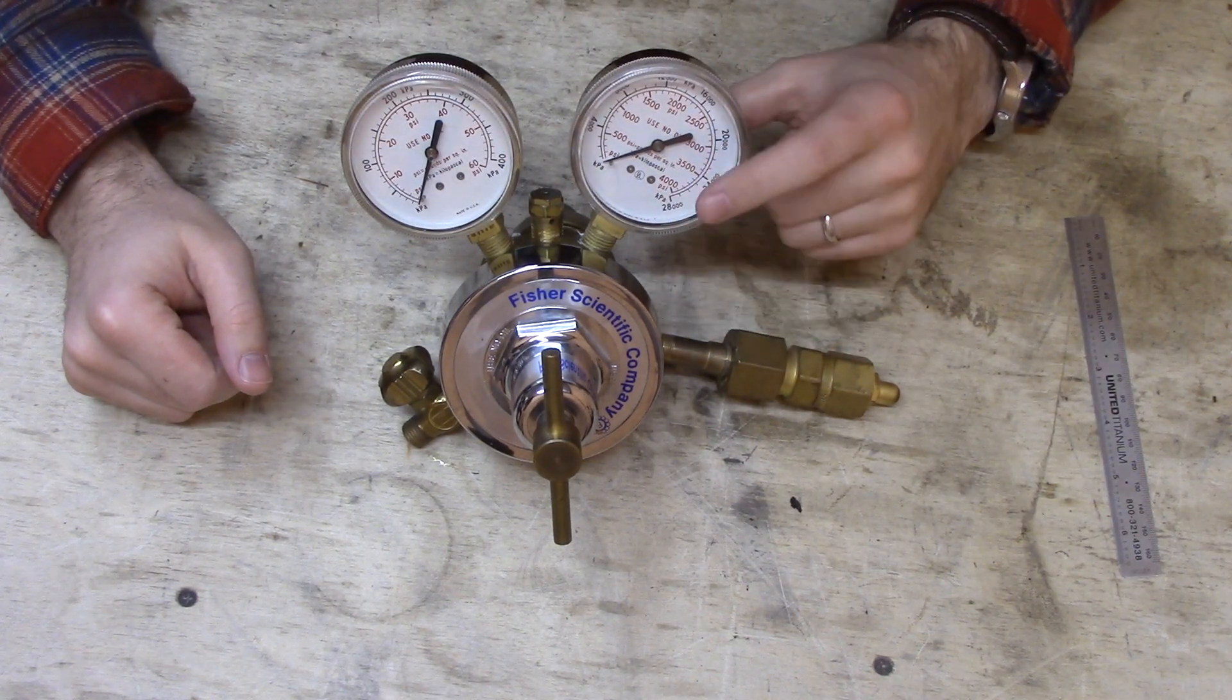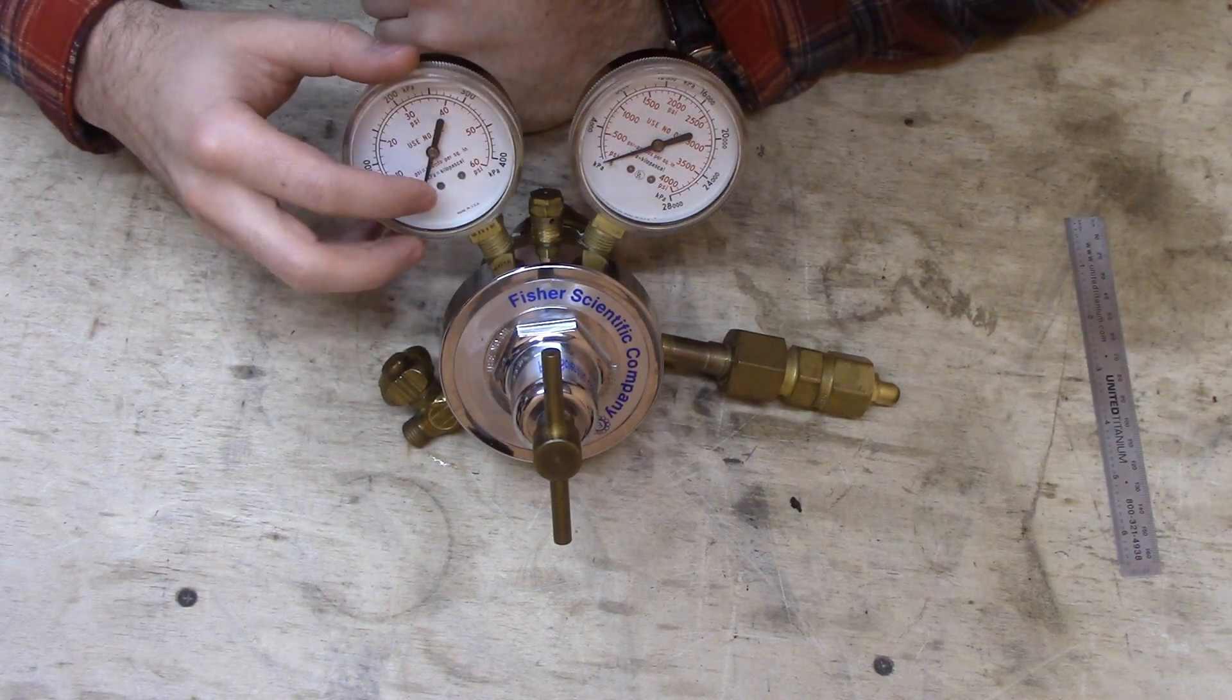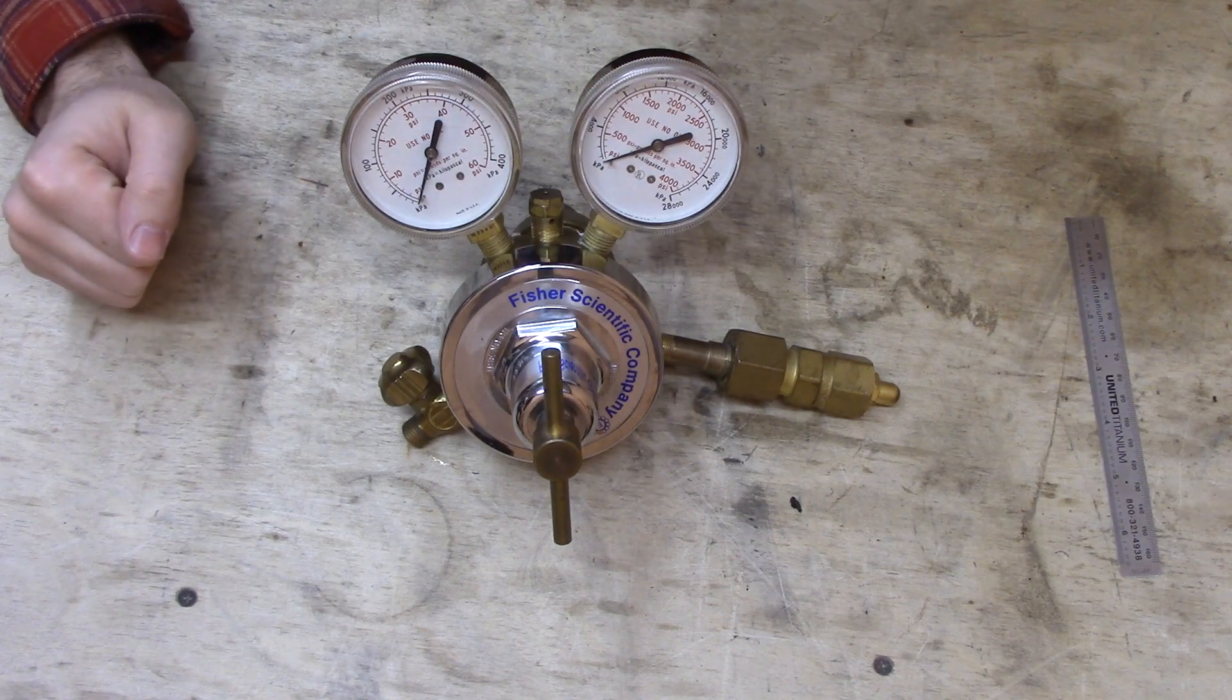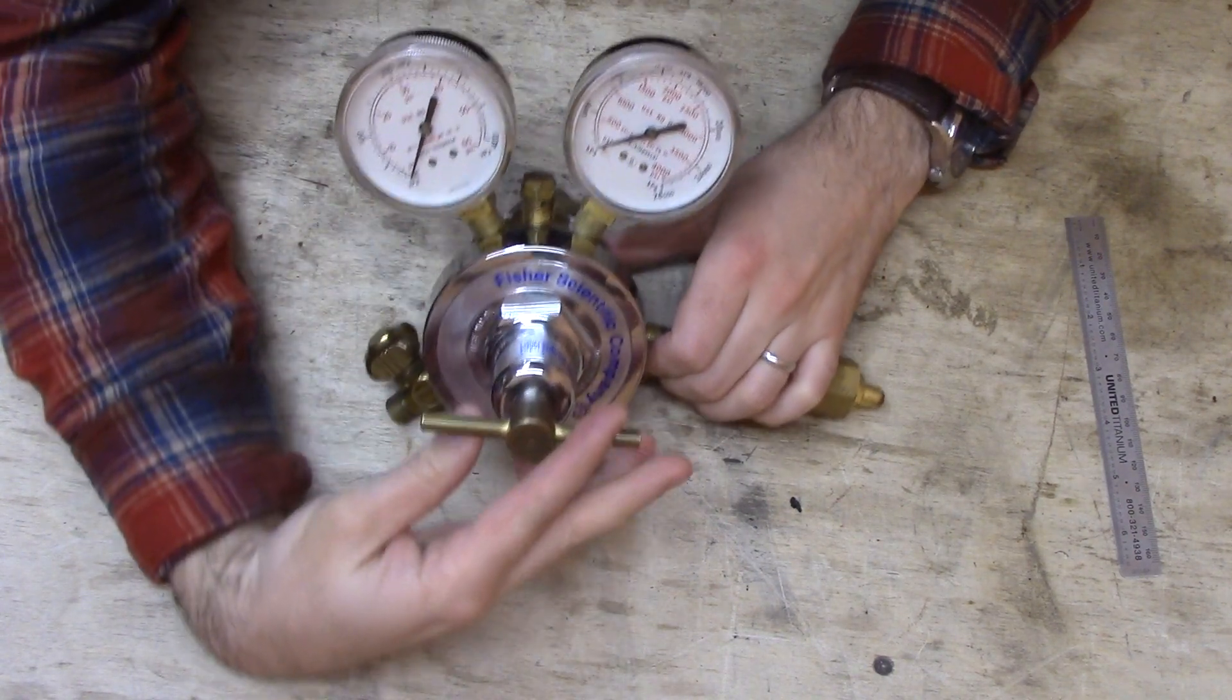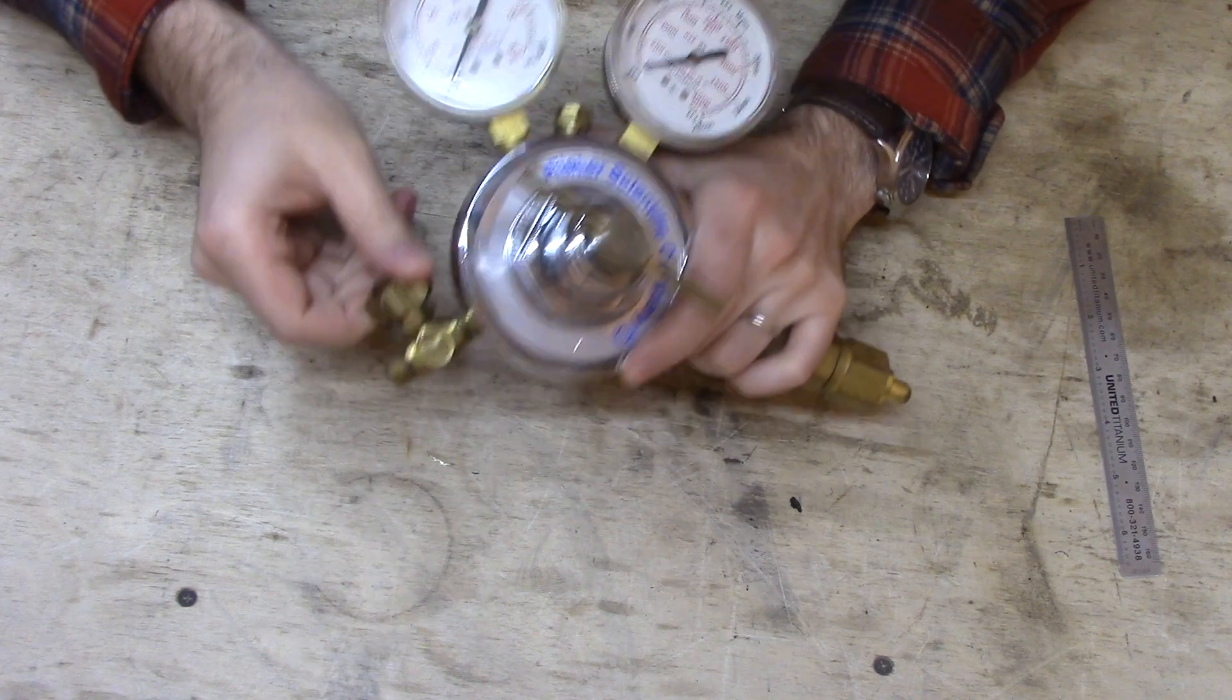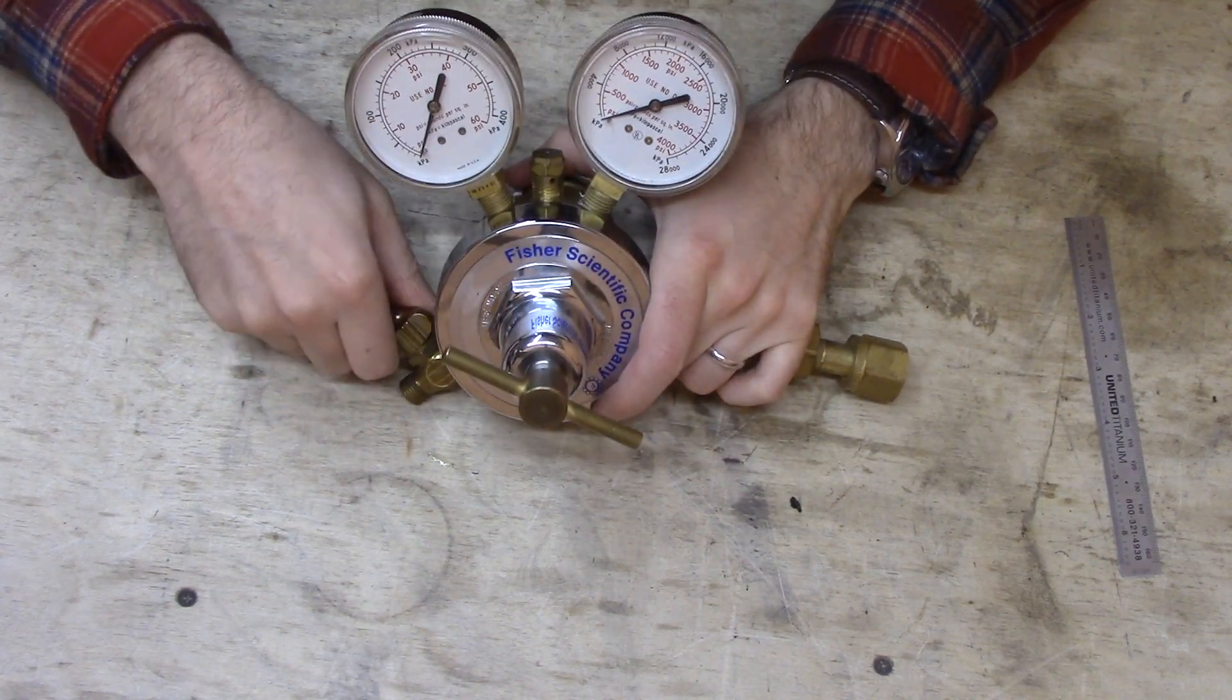I can tell by these two gauges. This one goes up to 4,000 psi—that's the inlet gas pressure. The outlet gas pressure gauge only goes up to 60 psi. The way that you adjust the outlet pressure is you turn this knob. By tightening it, you can increase that pressure.